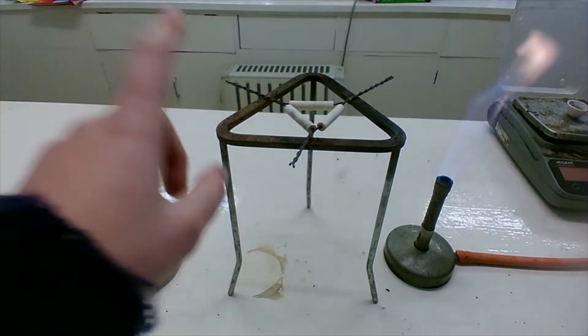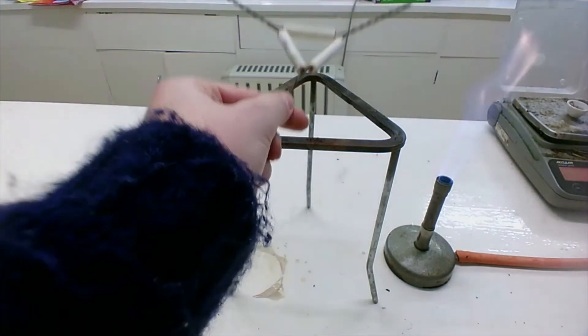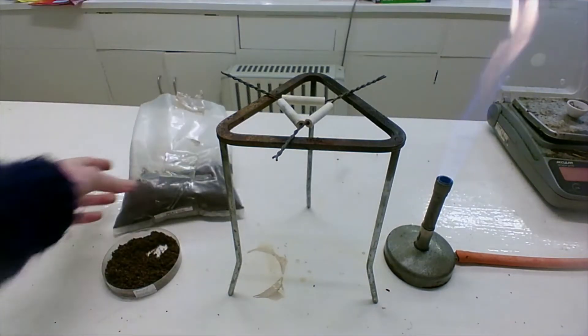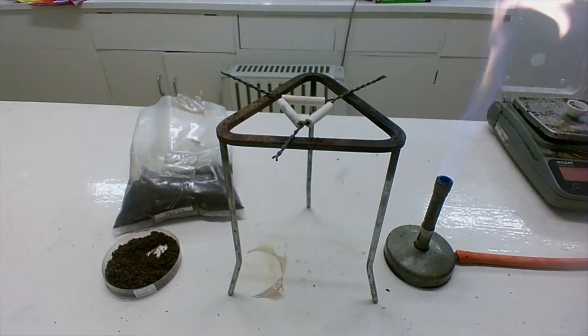I have my tripod, my pipe clay triangle. This is my clay soil sample and I'm also going to have a peat soil sample. I have my Bunsen burner and then I also have my crucible.